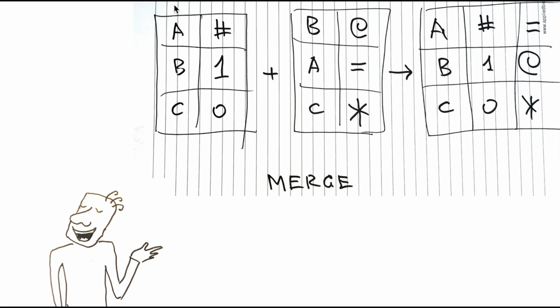So you have to indicate for the merge function that column 1 in table 1 and column 1 in table 2 are the columns used for a merger, and the function will generate the final table of 3 columns. It will not repeat this common column twice, it will make it only once, and merge all other columns in the right order relative to the column which you use for a merger. That's the trick.